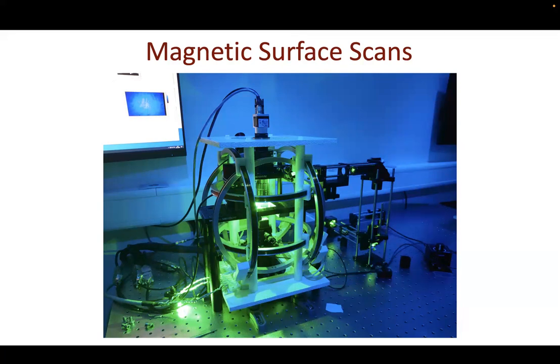But do keep in mind that a QDM is an optical technique, so we're actually looking at light. We're looking at very subtle changes in the fluorescence as a function of microwave frequency, and that gives information about the magnetic flux, or the magnetic signal, in a distinct layer in a diamond chip. That is the take-home message of how a QDM basically works.